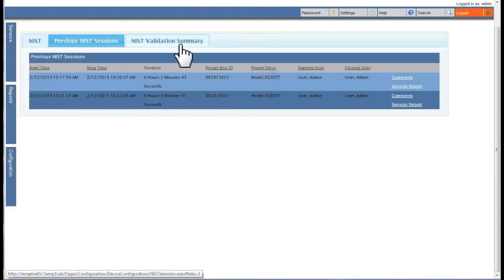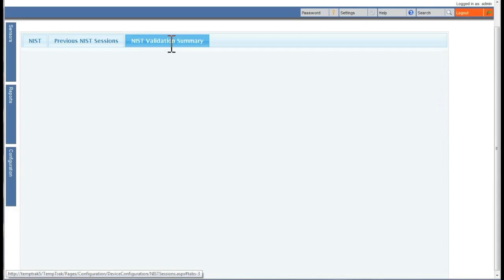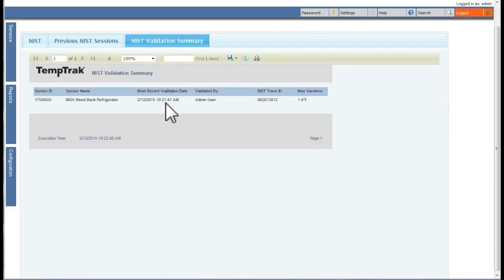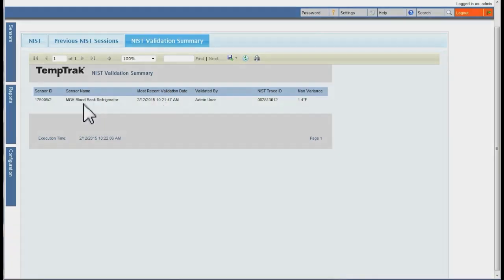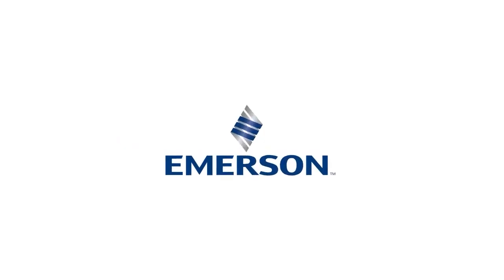The NIST validation summary tab shows a list of the most recent NIST sessions for transmitters that have been NIST validated.